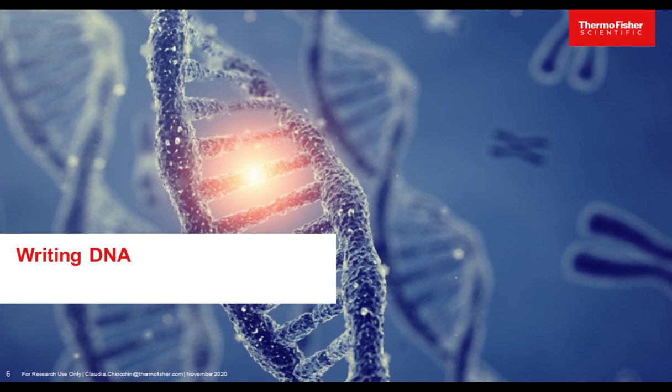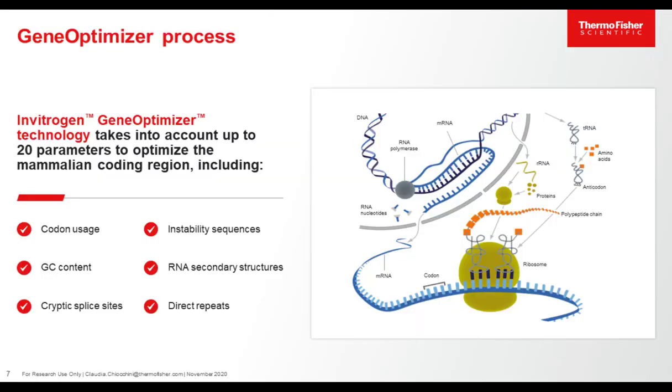Here at Thermo Fisher, we are considered experts in writing DNA. And with writing DNA, I mean really synthesizing DNA from scratch. In this process, it is crucial to adapt the DNA to your host organism. When we talk about heterologous gene expression, everyone understands the importance of the codon usage, since the genetic code is, yes, universal, but it is degenerate, so that an amino acid can be coded by different codons. And we know that the frequency with which codons are picked is different in each and every organism. And this correlates with the amount of transfer RNA present in the cell.